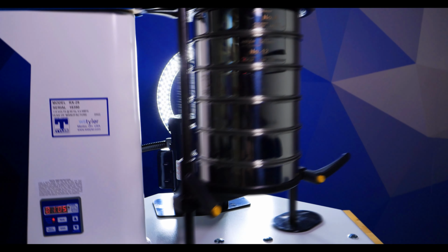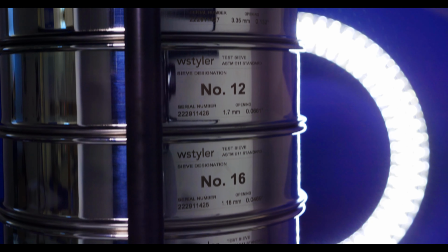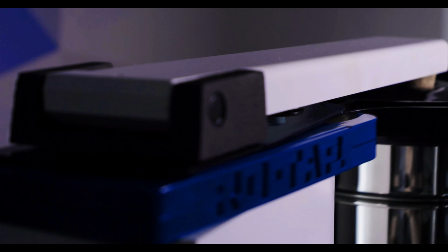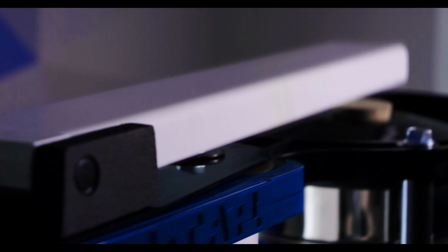And since the openings in the sieves get smaller throughout the stack, the row tap will slowly filter the particles down through the stack until they're separated into sieves with the mesh count that matches their particle size. And since the sieve shaker is designed to make every oscillation and tap exactly the same, you'll have consistent and repeatable results that are far more reproducible than hand sieving alone.